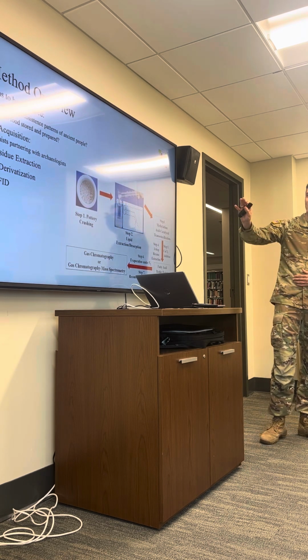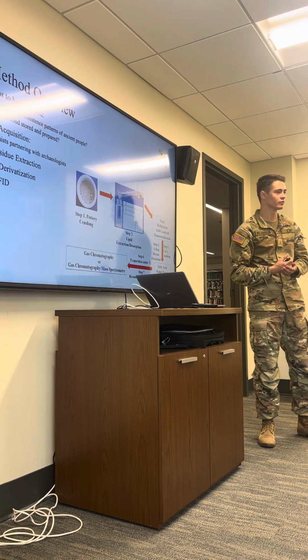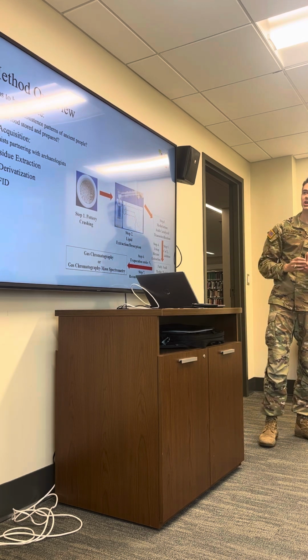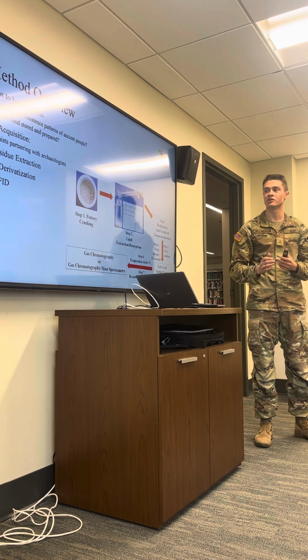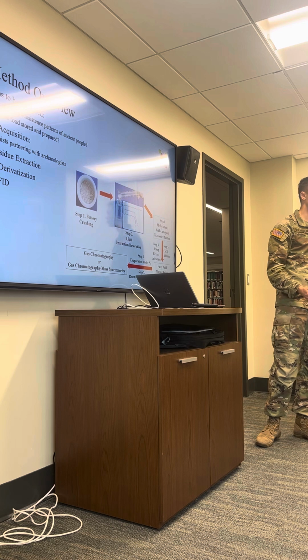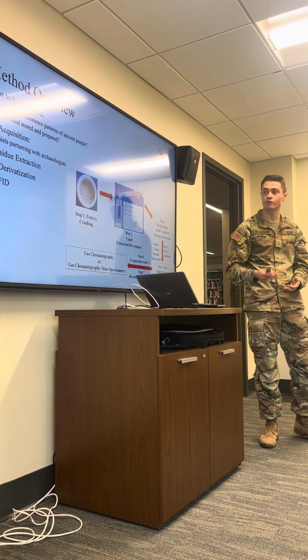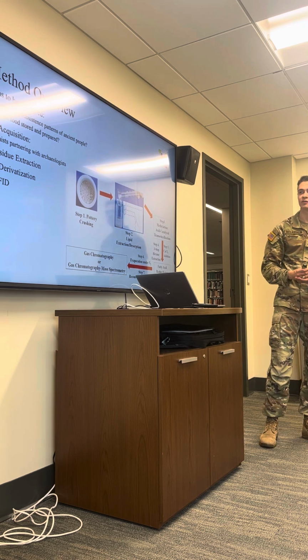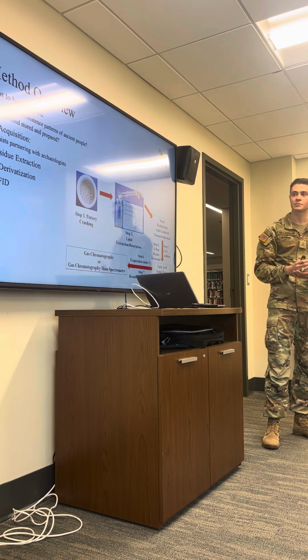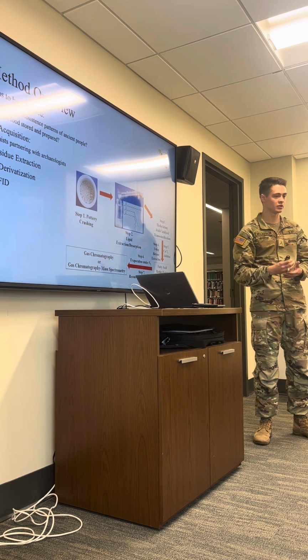So a quick overview of the method is that we are within the field of chemical archaeology, and the questions that we seek to answer is what were the subsistence patterns of ancient people, what were they eating, but also along with that, how is their food stored, and how do they prepare it? The first step of this begins with the acquisition of artifacts. In this case, it's pottery, and so chemists or labs partner with archaeologists to obtain these artifacts.